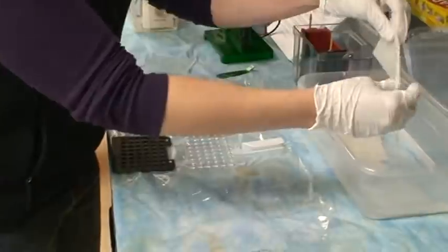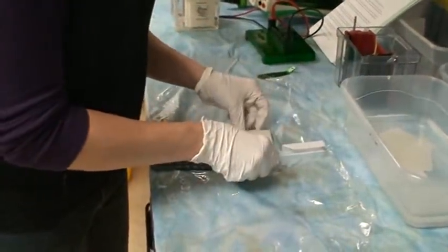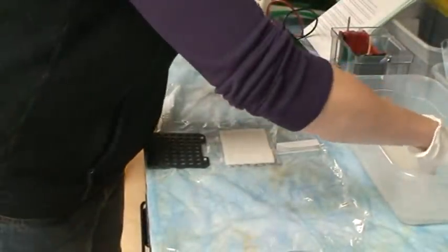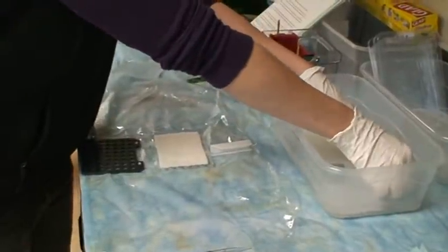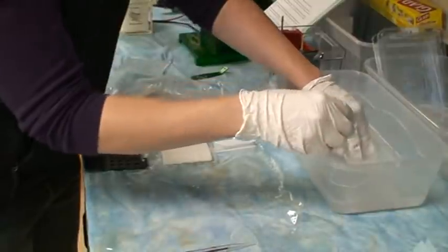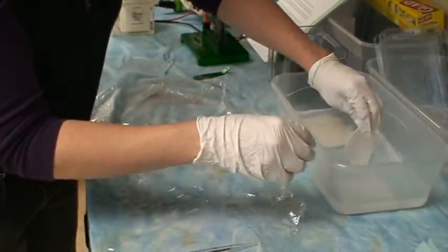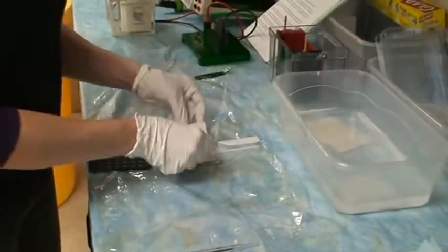You start with a sponge. Lay it down. Then you need one of your pieces of filter paper. Mine is sticking to my gel. There we go. Piece of filter paper, lay that down.